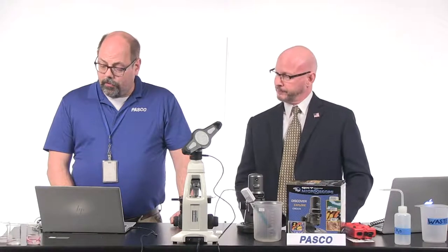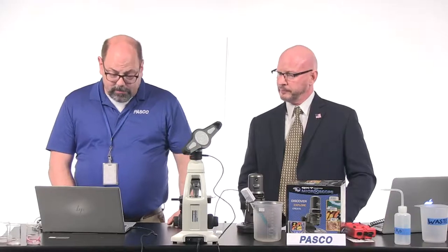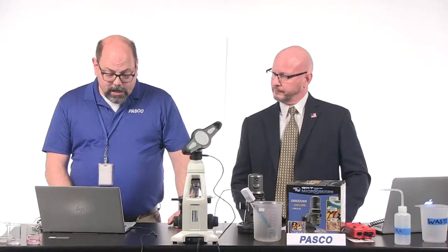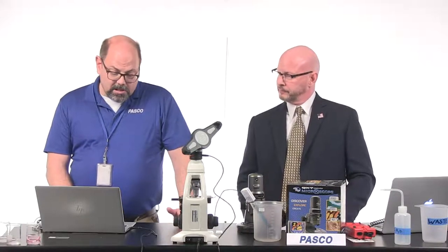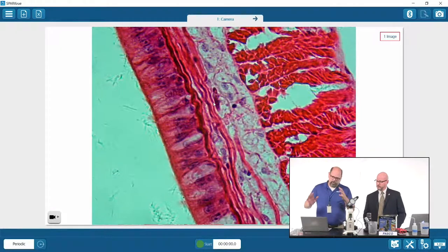Yeah, so if you want to see that whole process, I'm going to drop out and then go on to this microscope as we have here, so you see that process. I'm going to start up, and this could be a blank version of our Spark view. I've placed the slide in there just so we can start by seeing these. As we try to get through our PASCO lives, we've sort of staged some of this. But let's drop into this animal cell here.